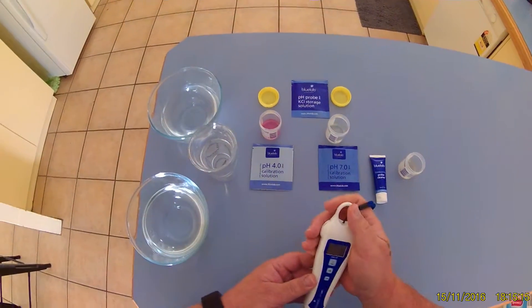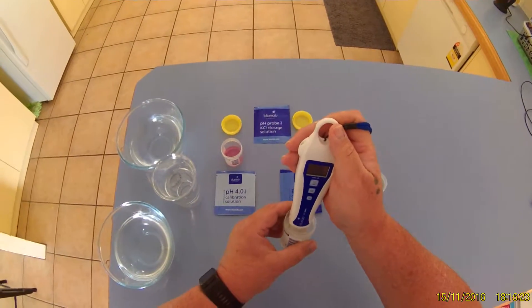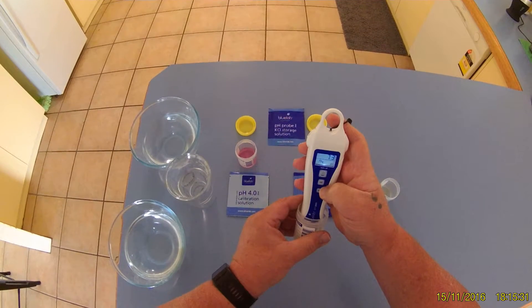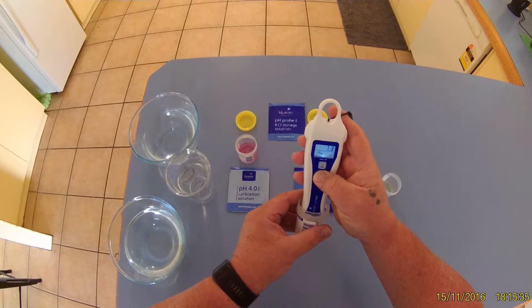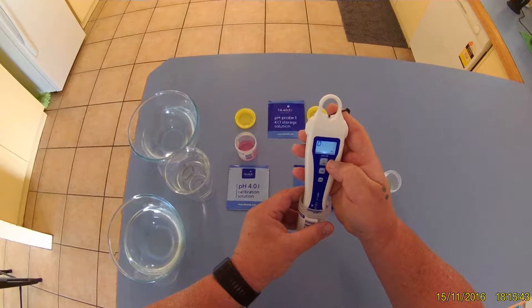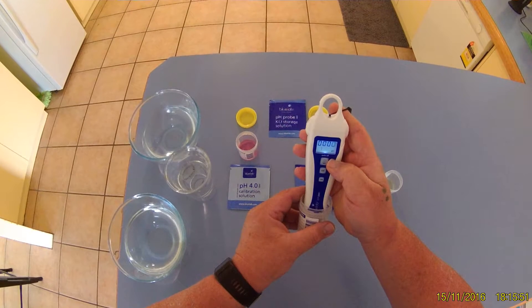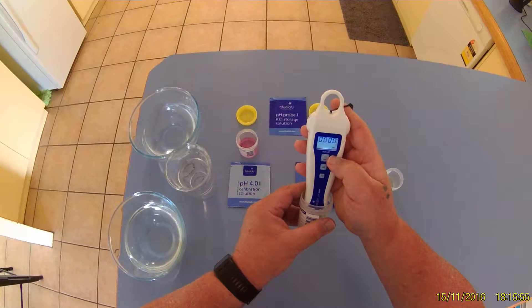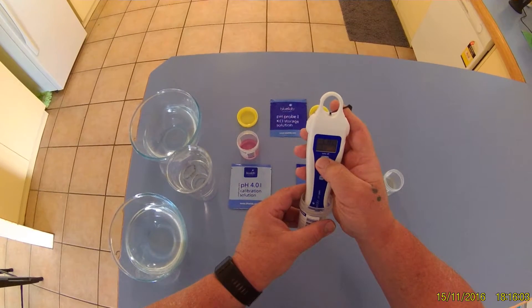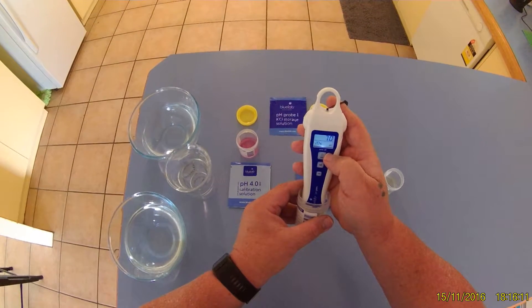Then we take our pH 7 calibration solution, turn the pen on, and hold it in there until we get a reading. Then we hold the calibration key until we get 'calibrate', and then it says seven. I'll turn the light on — it came up and said CAL 7.